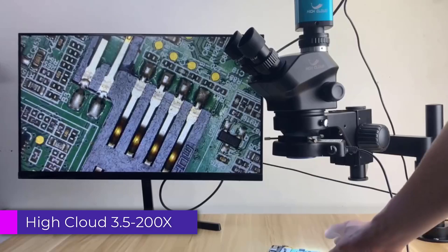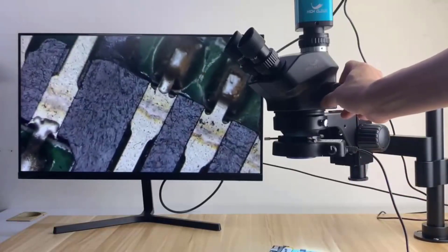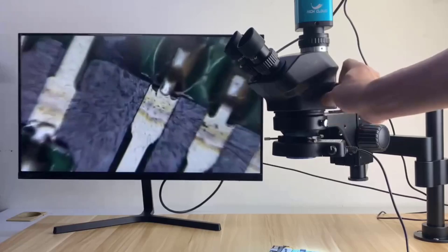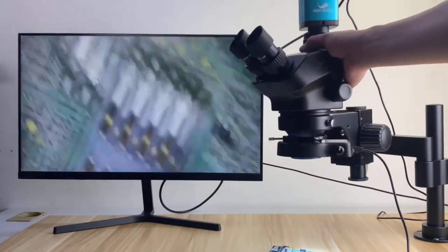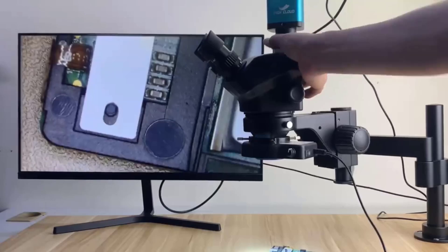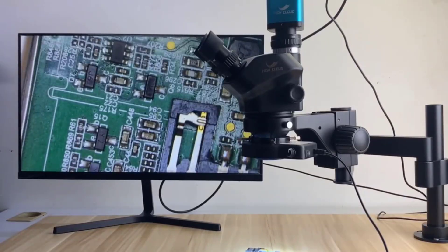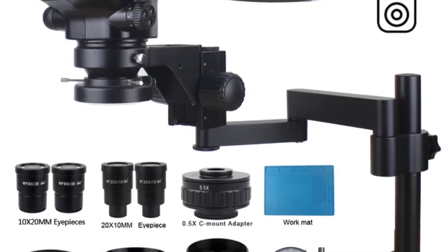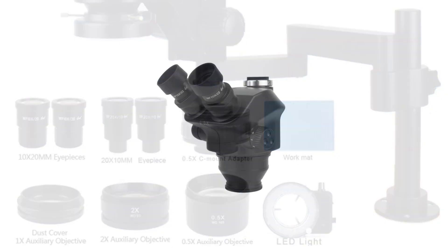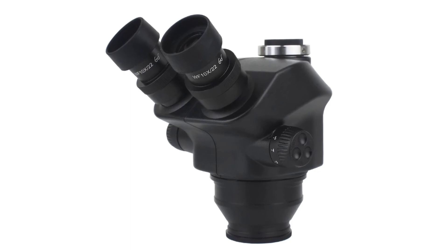Number 3. High Cloud 3.5-200X Stereo Trinocular Microscope. The High Cloud 3.5-200X is an impressive tool designed for professionals in fields like electronics repair, jewelry observation, and detailed soldering work. This microscope offers versatility and precision, making it a valuable addition to any technical workspace. Its solid build, excellent optical performance, and advanced camera features make it a valuable investment for anyone involved in intricate repair work or detailed inspections. While it may be on the higher end of the price spectrum, the features and build quality justify the cost, making it a recommended purchase for serious users.